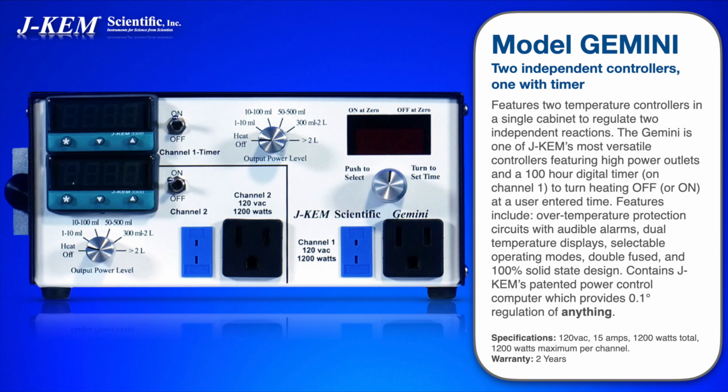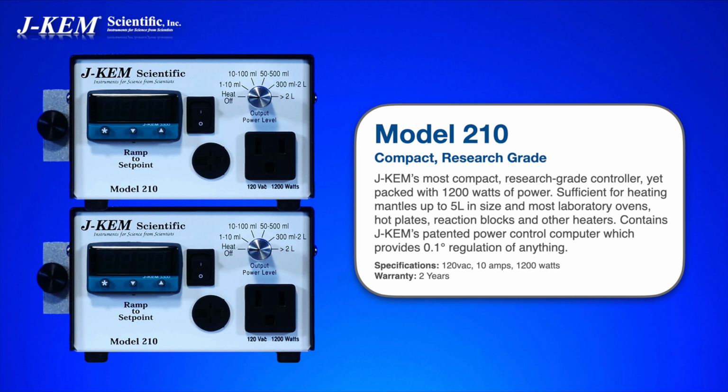If you want to remove some of the clutter of setting up 2 reactions with 2 temperature controllers in your hood, then a Gemini, for example, is a good choice. It's one controller, it's one instrument with 2 temperature controllers built into it. But another consideration is that there are times when you would want 2 separate controllers.